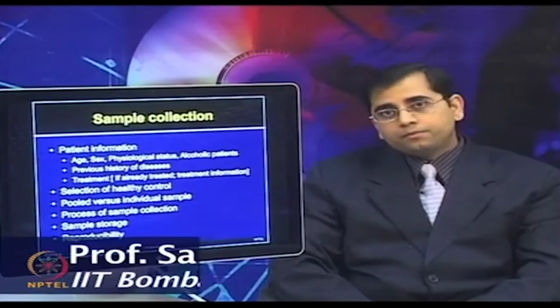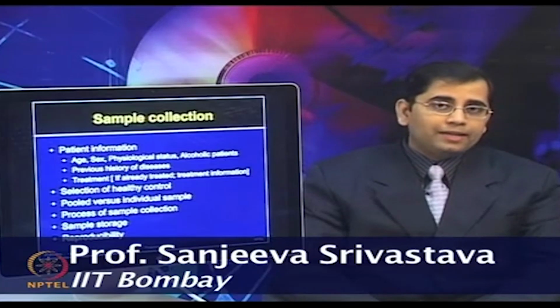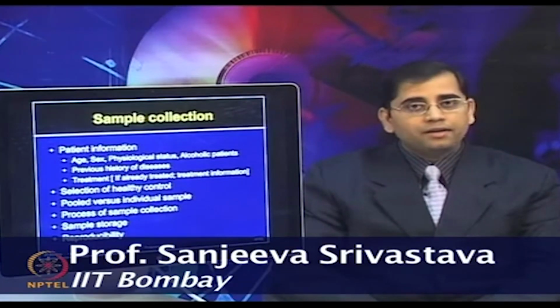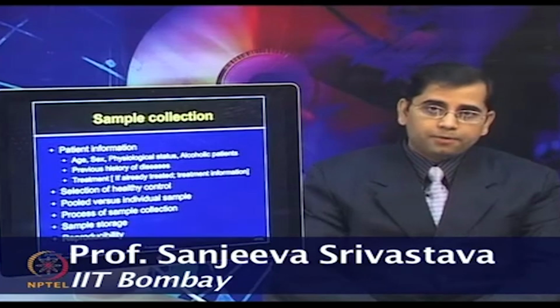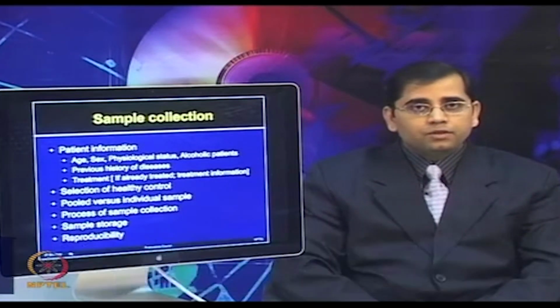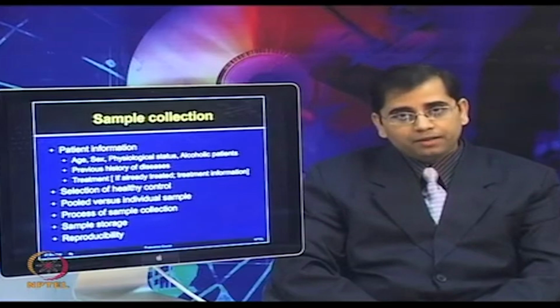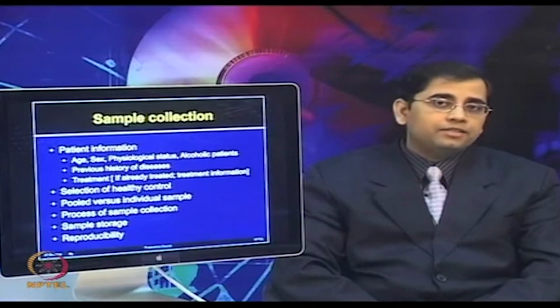Okay, after watching this animation, now you must be clear of various steps which are required to perform this experiment. In clinical studies, first of all, obtaining the clinical samples and getting the right type of clinical sample is a very challenging question.